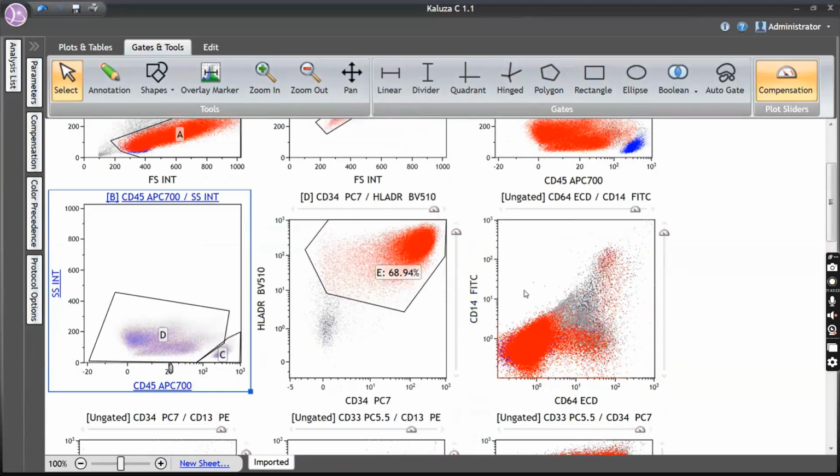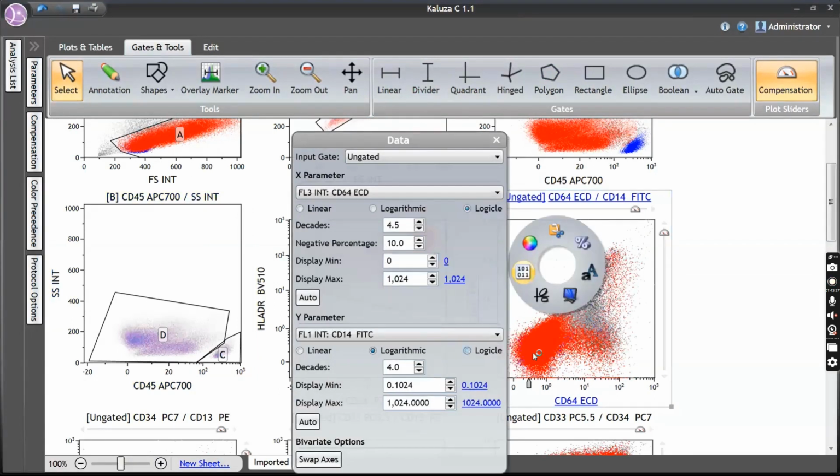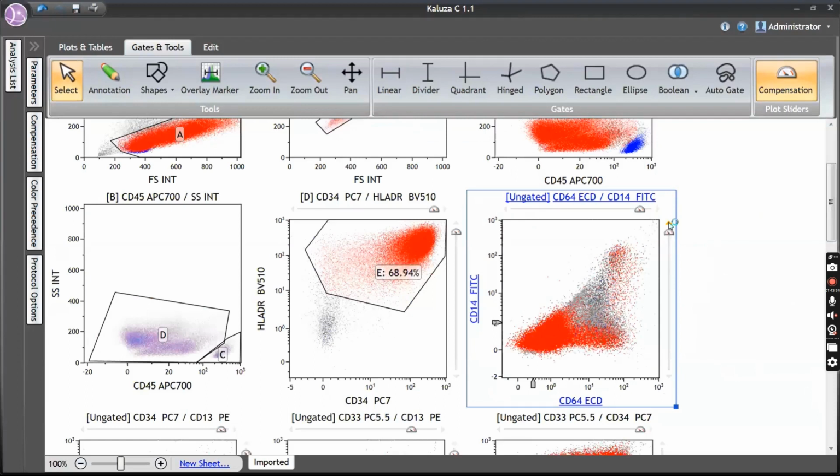Okay, now the basic question that was raised for this case is, is it a B-ALL or an MPAL? Well, that is what we're going to answer now. So still you can define the blast here because some monocytes are included, which are CD14 and CD64 positive.